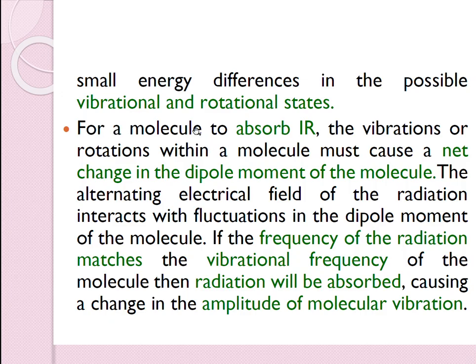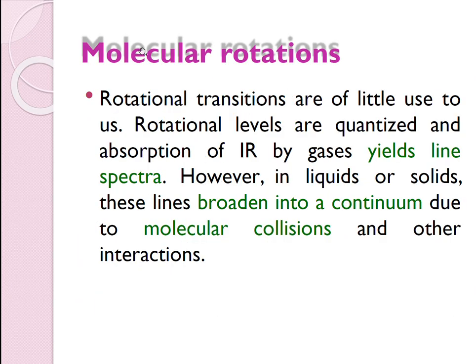Sometimes molecules receive some energy, and by utilizing that energy, they undergo some electronic transition or rotation or vibration, based on the nature of the incoming radiation. So this phenomenon actually happens within the molecule.